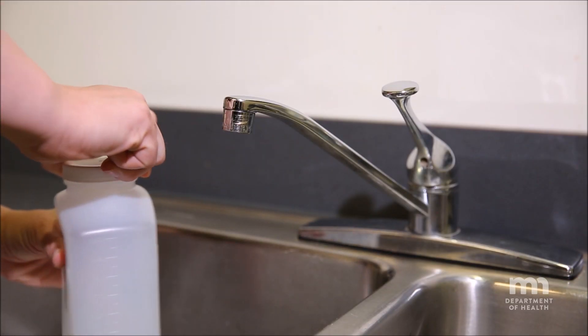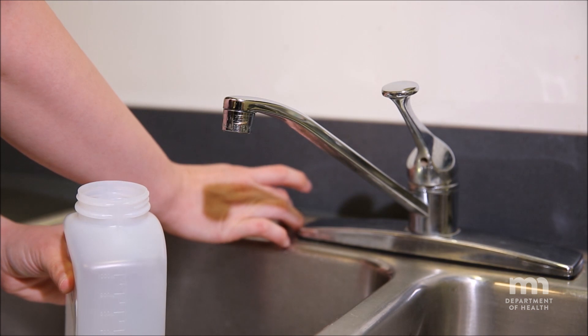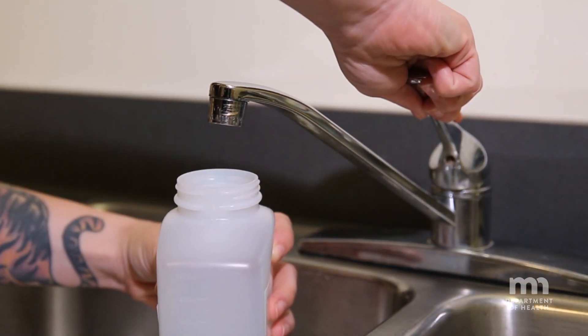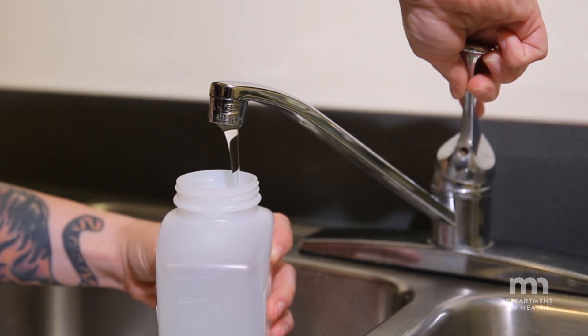When you are ready to take the sample, remove the cap from the bottle and position the bottle under the faucet. Slowly turn on the cold water as if you are filling a glass of water.